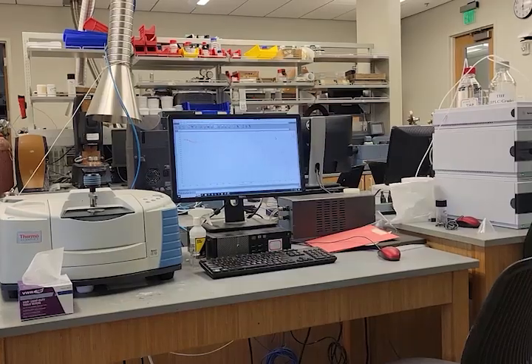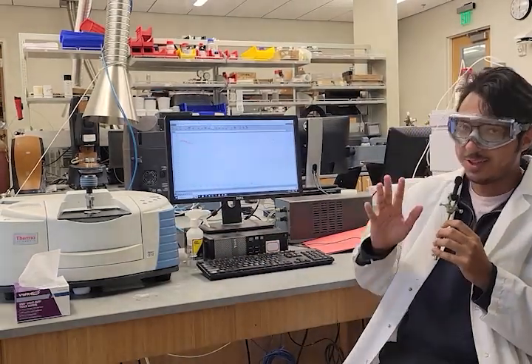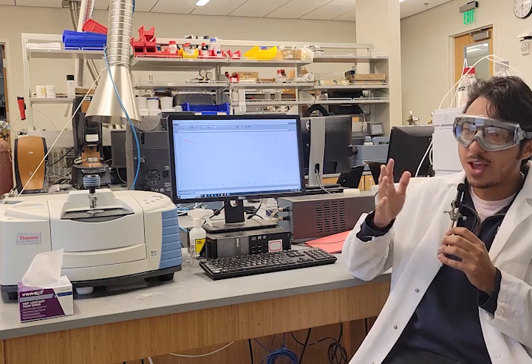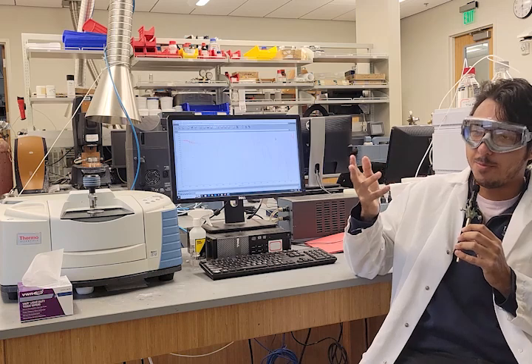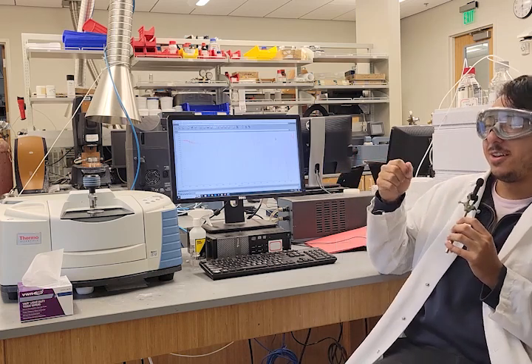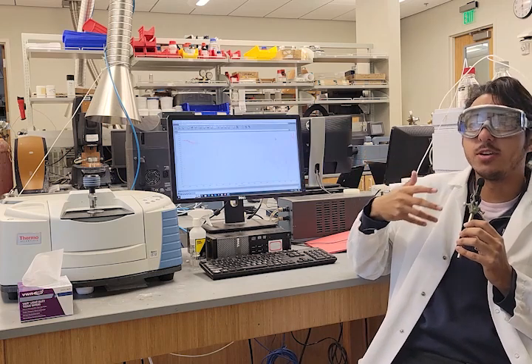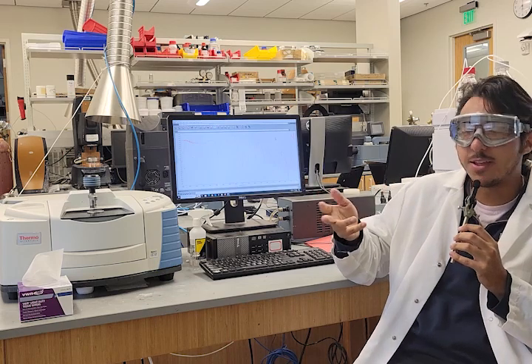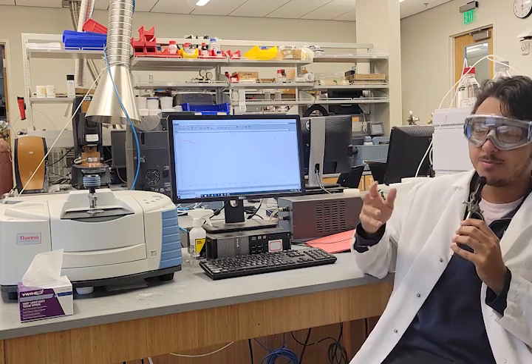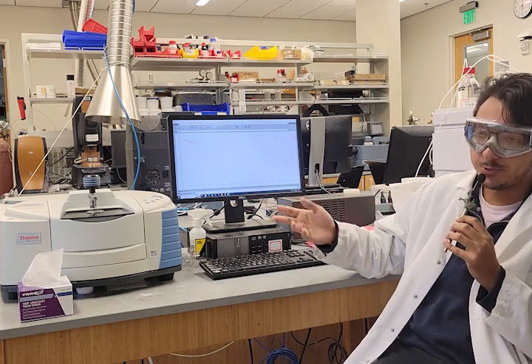Before we get started with characterization, we have to put on our appropriate PPE for the lab. So now technically, outside of lab hours, if you have permission to, you're able to wear minimal PPE in terms of just goggles. And if you're doing reactions or doing anything with chemicals, obviously you're gonna wear gloves, right? But you don't have to wear a lab coat, but I am for the purposes of this video. But I don't have any gloves on because I'm not doing any chemistry.